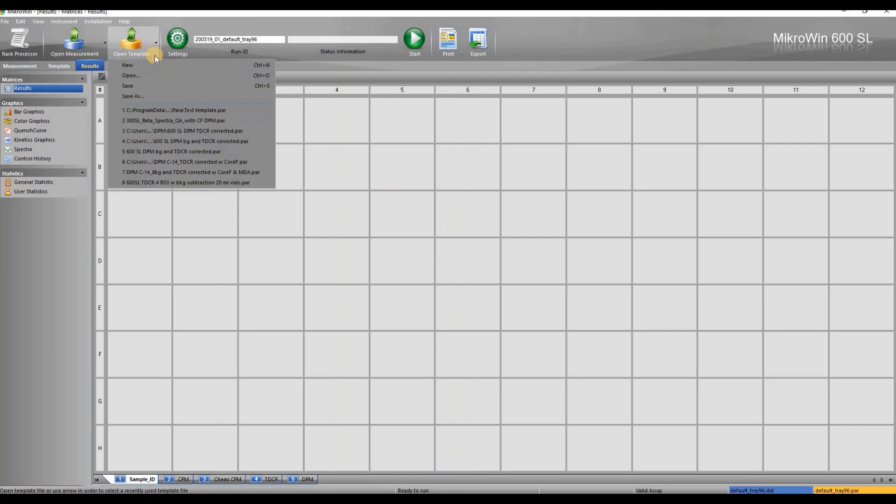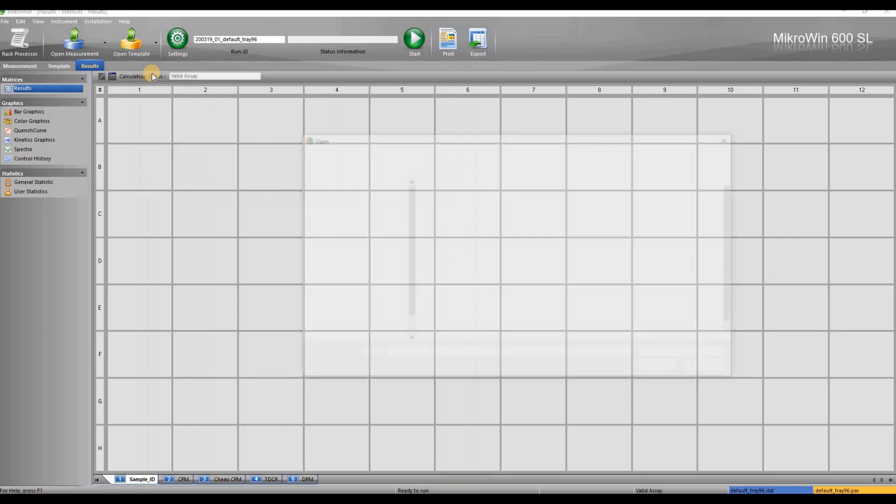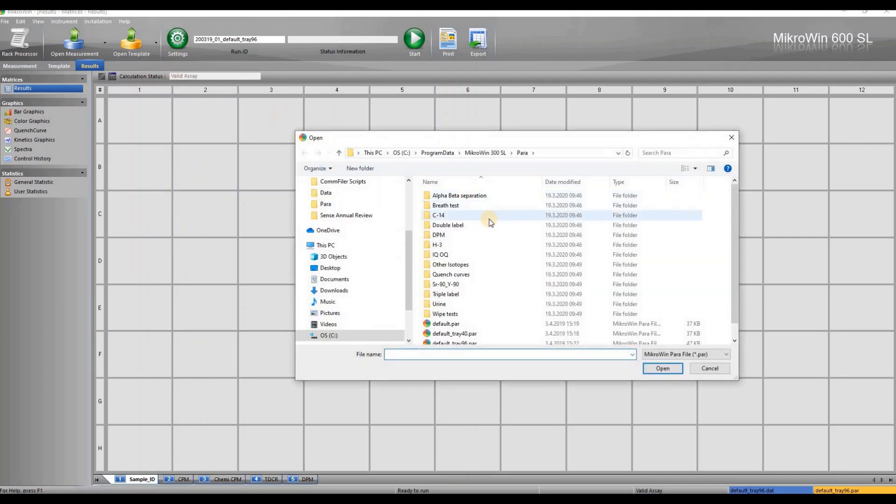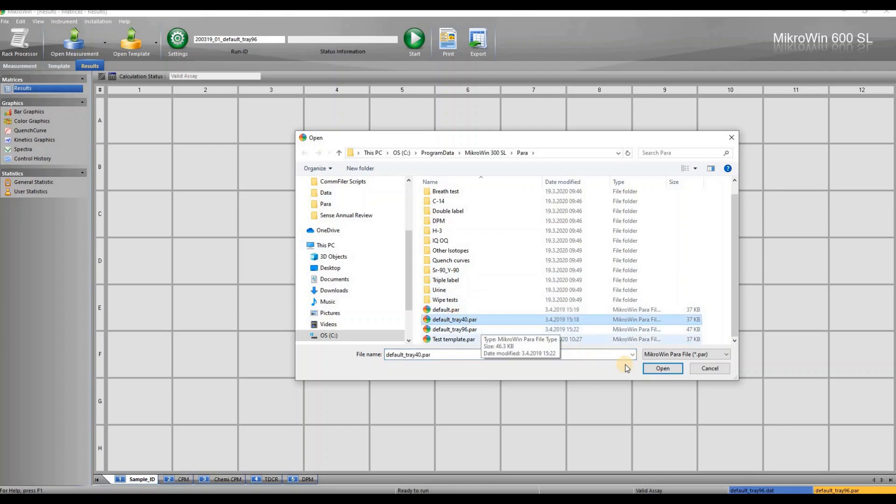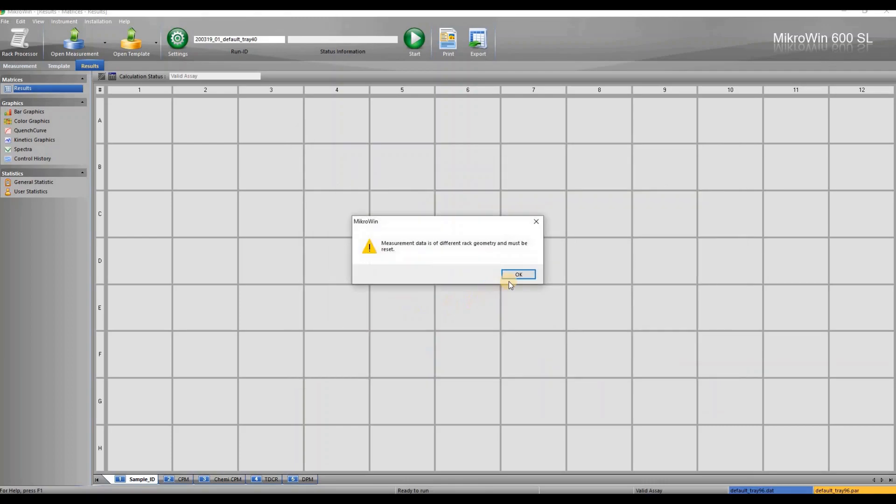With the small arrow beside the open template button you can see more options such as save or save as. We are going to open another default template for larger sample files. The software gives us a warning that the geometry is changing. Just click OK to that.